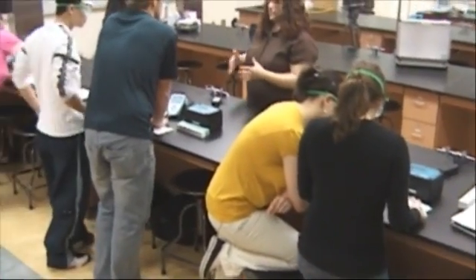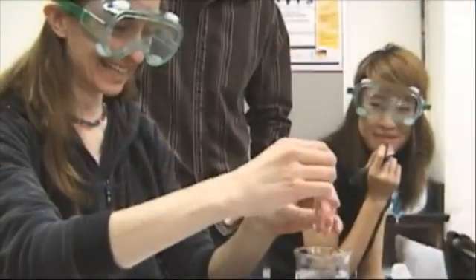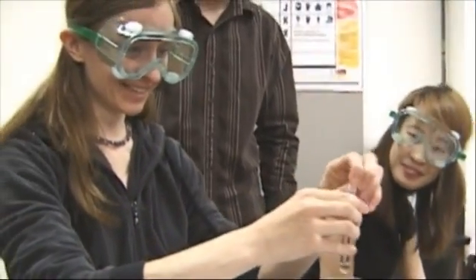Introducing Gas Chromatography with Vernier. Vernier's gas chromatograph, the Mini-GC, represents breakthrough technology for science educators teaching organic, general, and even high school chemistry.